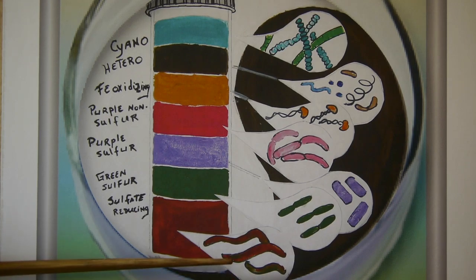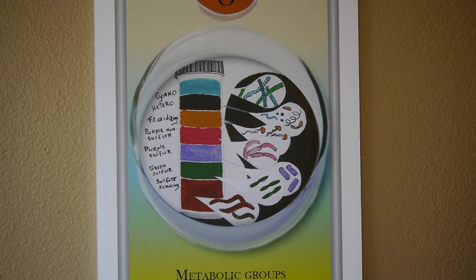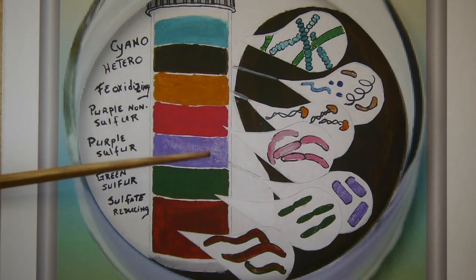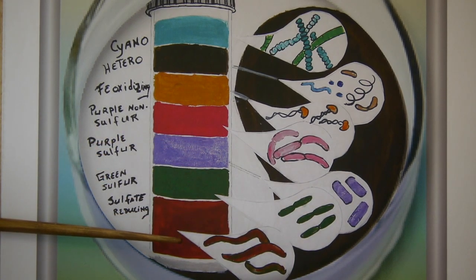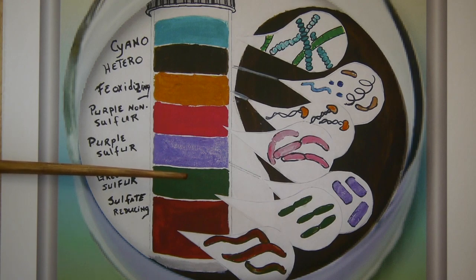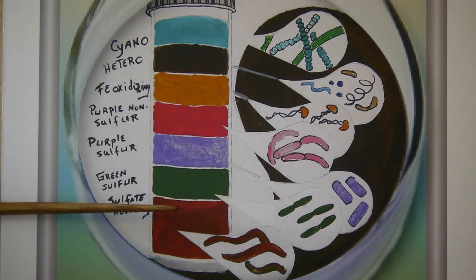The microbes that grow in this column are predictable as they fall within certain metabolic groups. In such a system, the microbes in each layer congregate in the area that provides them with their ideal conditions for growth. The microbial populations that end up in each layer will feed off the waste products from their adjoining layers and provide their own waste that's scavenged by their neighbors too. In this way, each microbial group shares its wealth, as there are always neighboring populations that will use their byproducts as food.